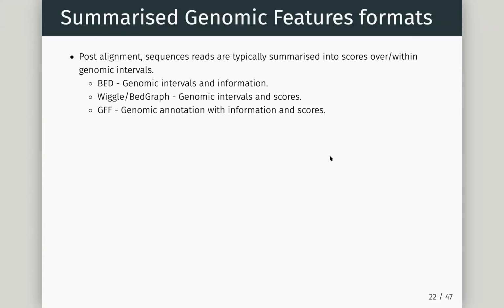So that's how you go from unaligned to aligned data. But actually, much of the time, with aligned data, BAM files, you will work very quickly to try and move them into something more summarized. Maybe it will be the number of reads from my ATAC-seq experiment. I'm looking for open regions in the genome, and the number of those reads around transcriptional start sites gives me an idea how open a TSS is. Maybe I want to know the signal across every base pair, how many reads I had stacking up for my RNA-seq data. So these are all very summarized.